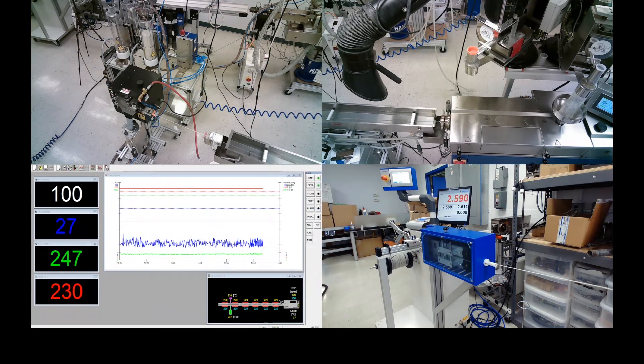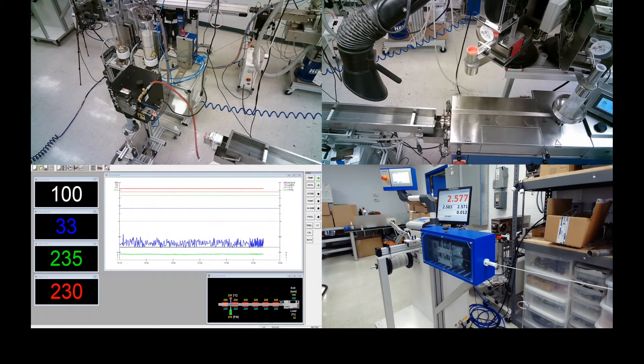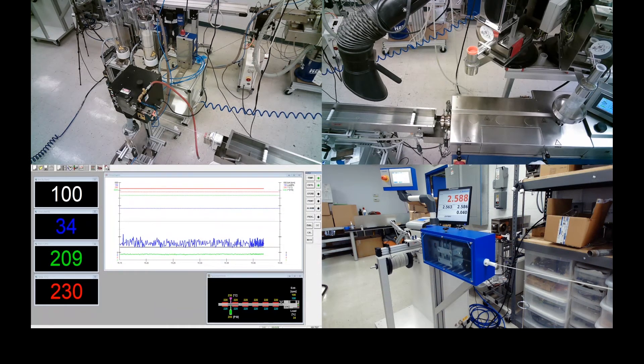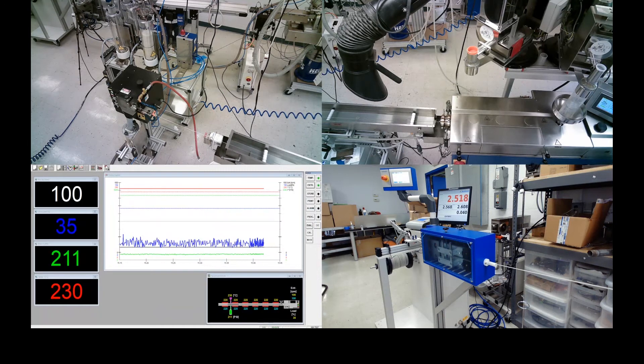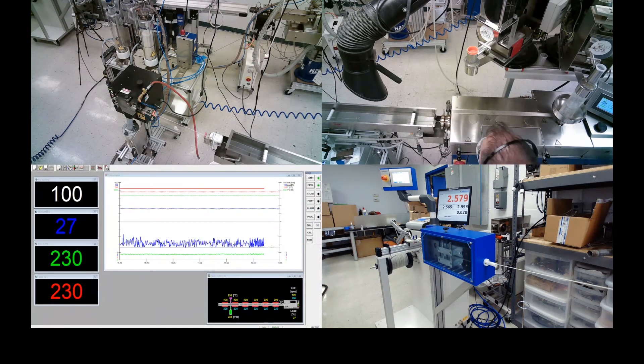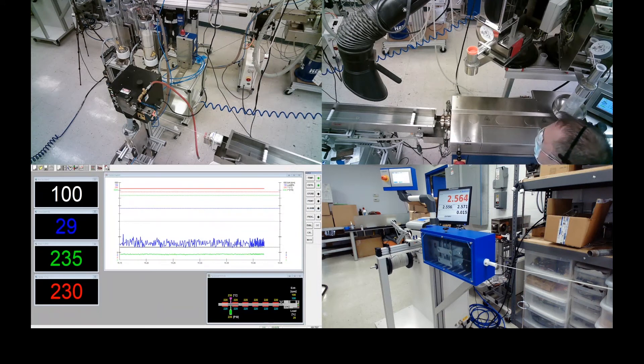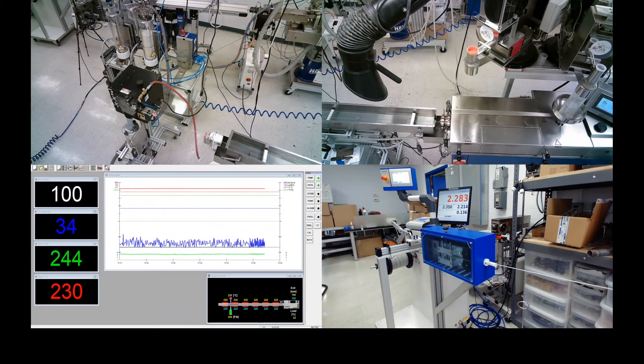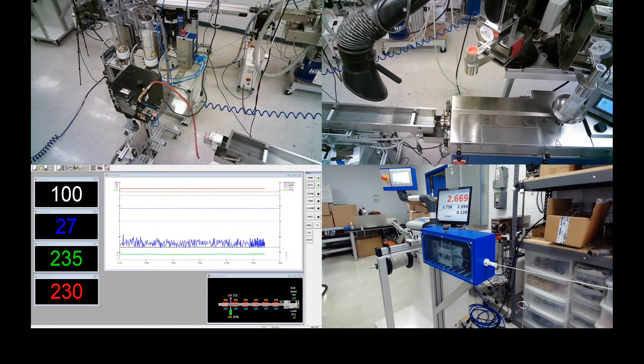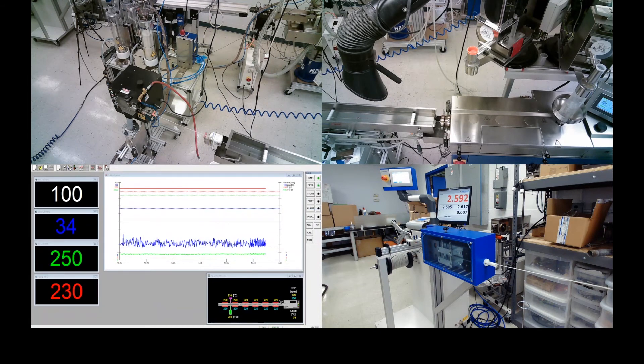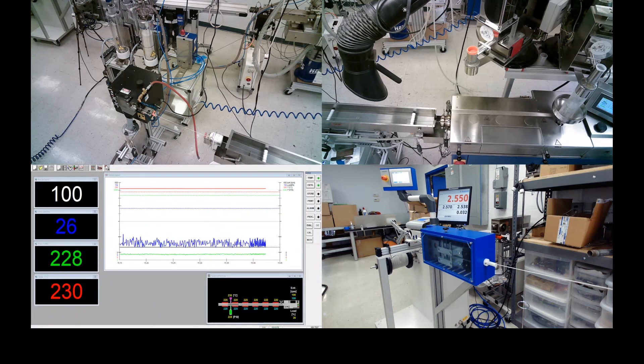As well as another added feature for our virtual laboratory, we can then make special dedicated slices for whenever you have a sample run with the set parameter window where you would see exactly how your material got created and what exact parameters led to that result.